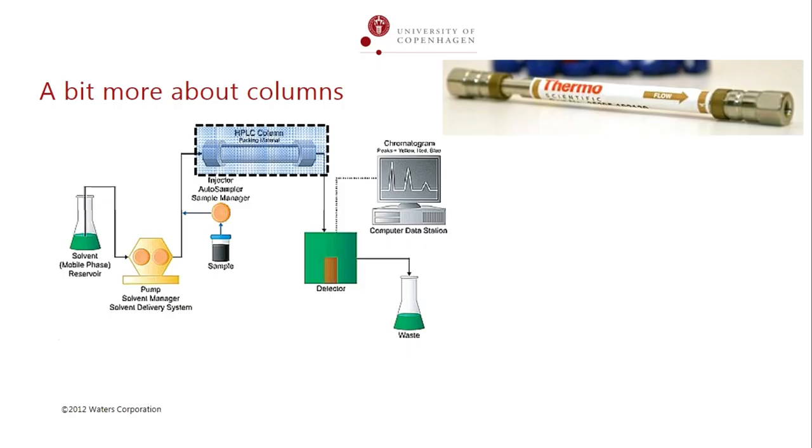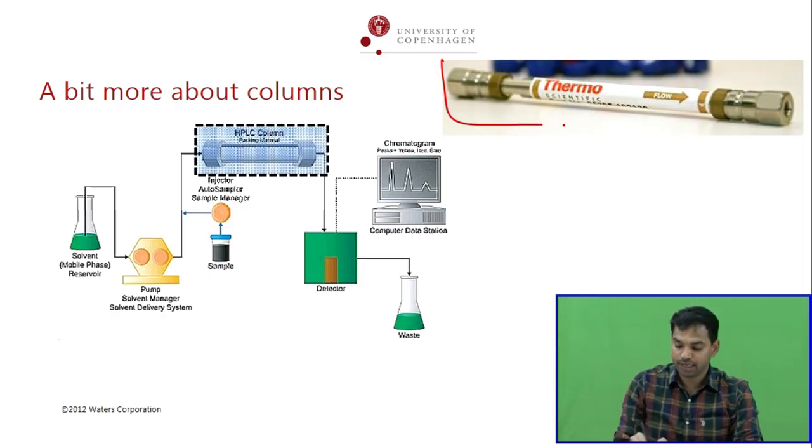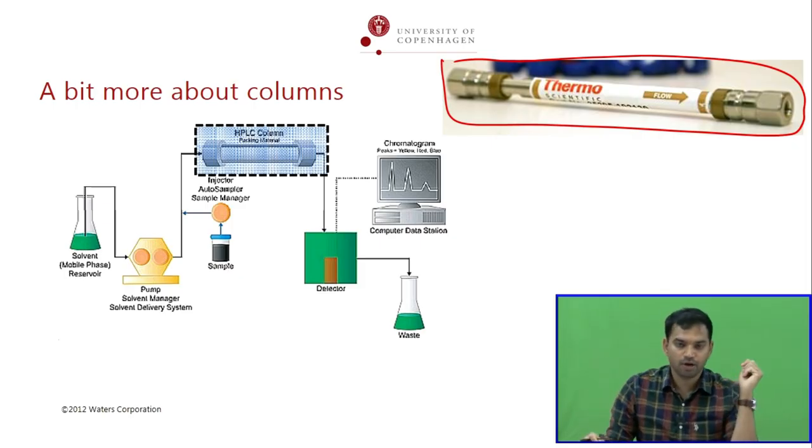Now I'll talk a little bit more about the HPLC column. Okay, it's a very important subject. HPLC column looks like this. Have you seen it before? It comes in different lengths, dimensions, and so on. An HPLC column looks like this.